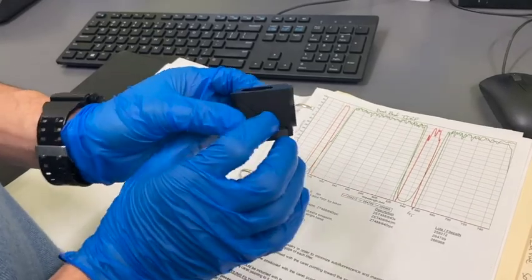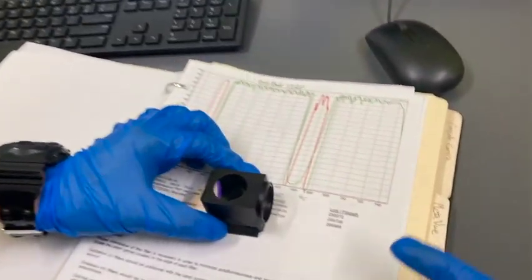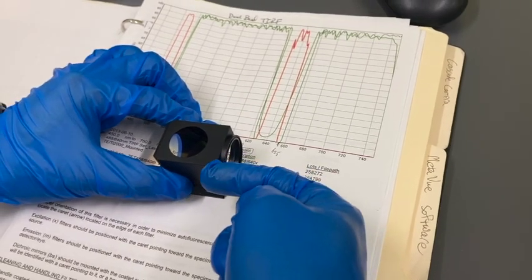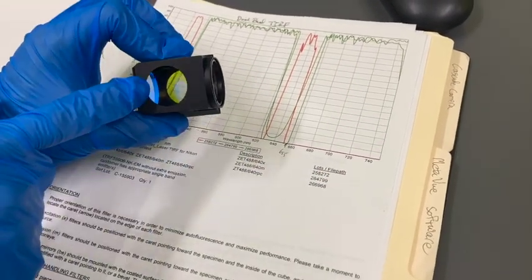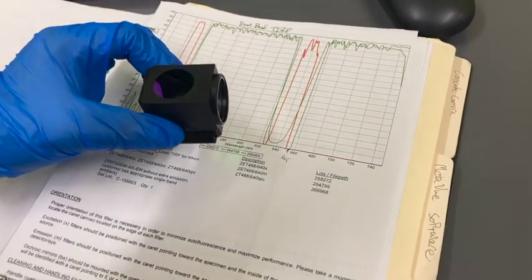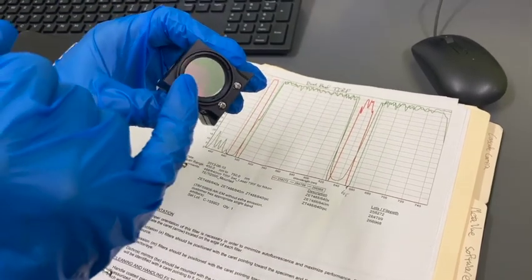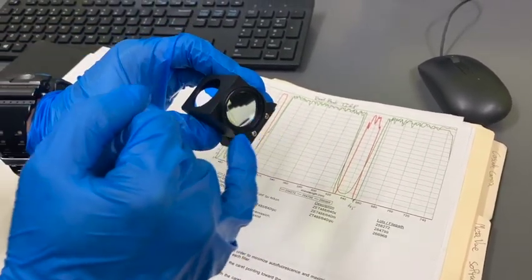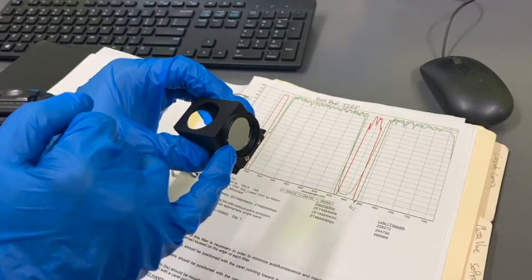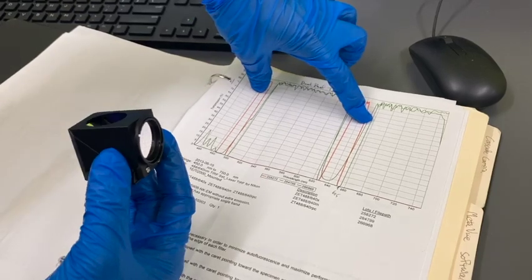When it's inside the turret, it's going to sit in this orientation. We have our laser going in this direction. Laser coming on, and we have a mirror, which is our dichroic mirror, to reflect our laser. And actually, we have a filter here. This is our excitation filter, and this excitation filter is our red here.